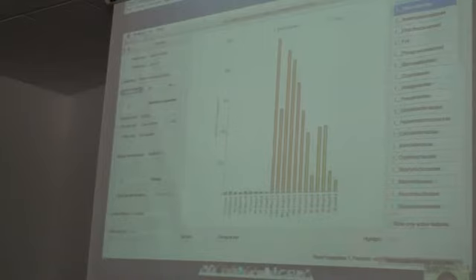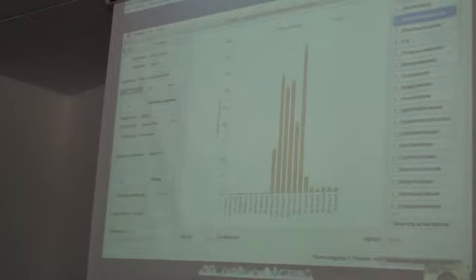This over. And so now we can see what the data looks like. So we can see why this p-value is created for the ANOVA. You can see the number of sequences for the young group here is quite small, and then the middle and old group are significantly more. And then as you click through these different things, you can look to see what those plots look like.